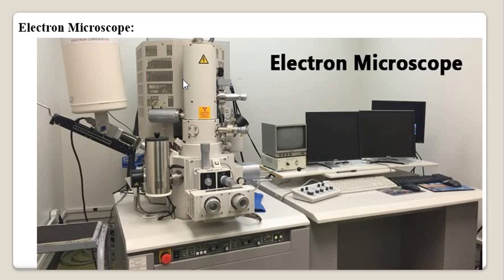Now after that, let's see the construction of this electron microscope. For the construction of the electron microscope, an electron gun is used, and then a microscopic column is also there. The electron gun is located at the top of the microscope body, and it is the source of electrons, right? The electron gun is used as a source of electrons.